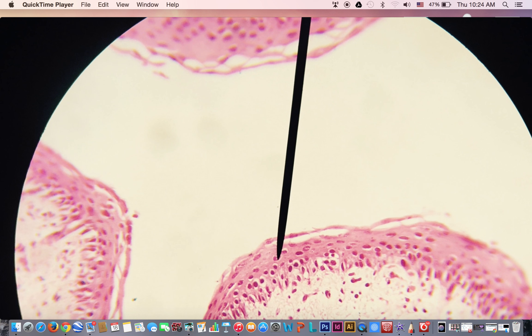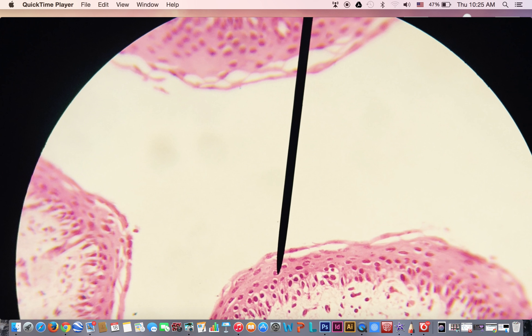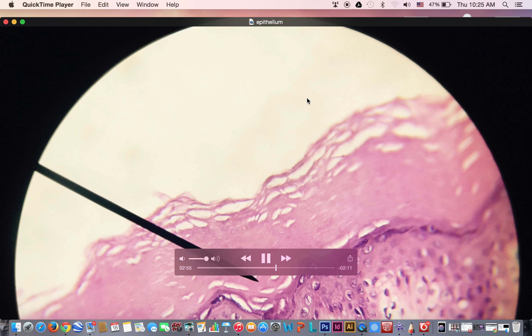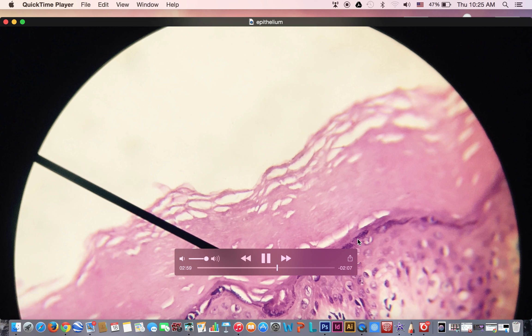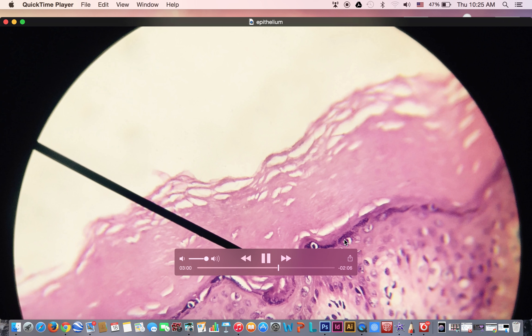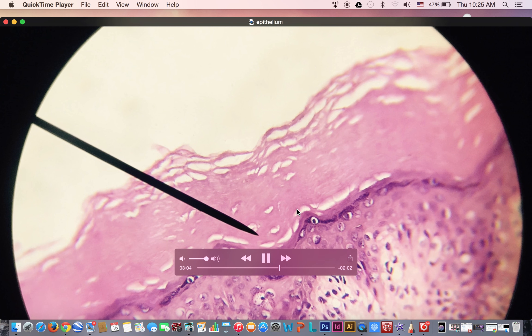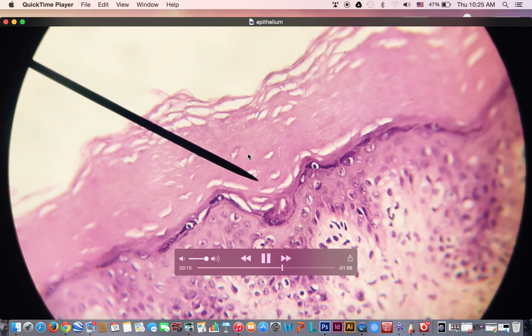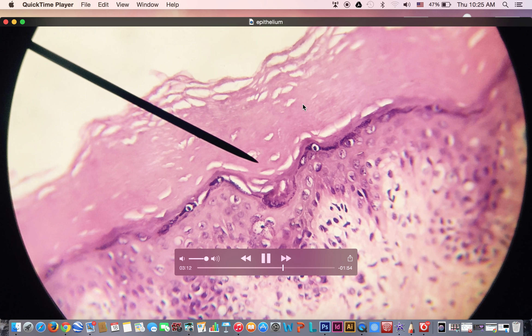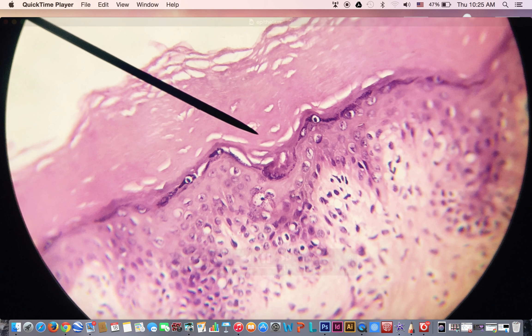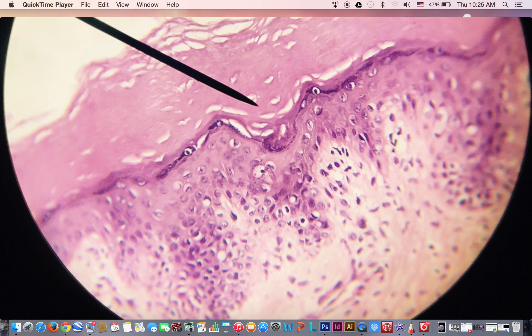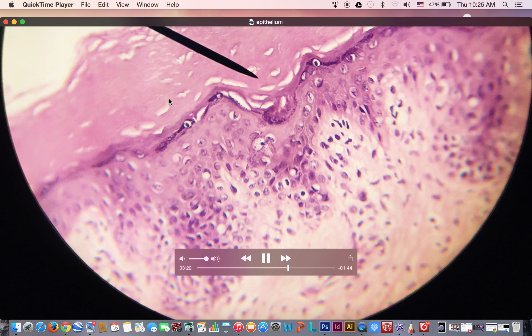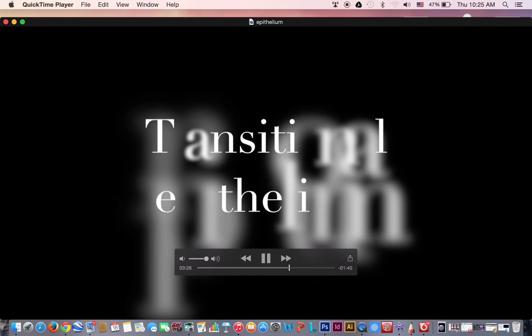The keratinized stratified squamous epithelium is formed of many layers of cells. The top cells are flat squamous, as seen by the flat nuclei, and above them is a non-nucleated pink layer — the keratin layer. This is the keratinized stratified squamous epithelium, present in the epidermis of the skin. The keratin is produced by the death of the cells.